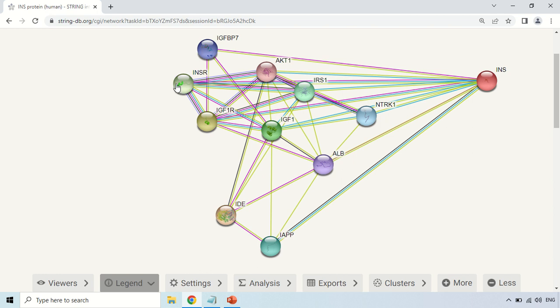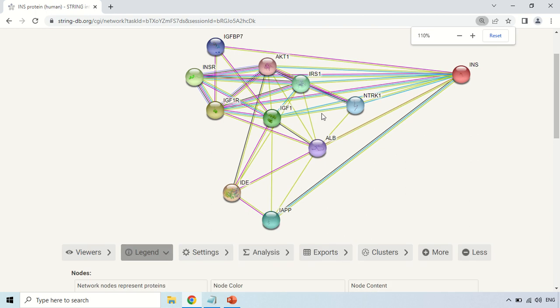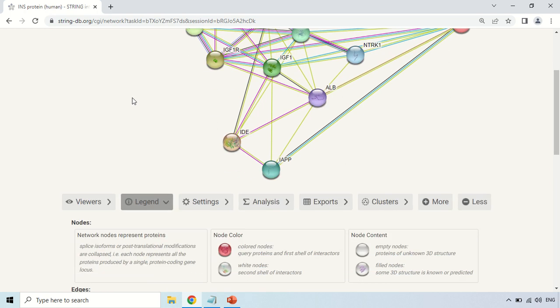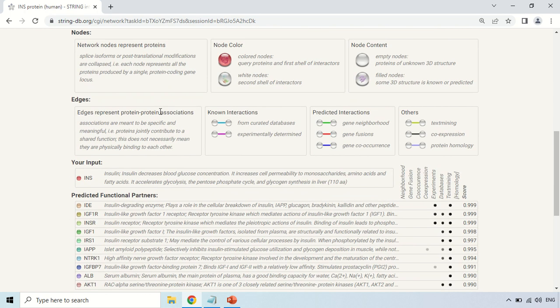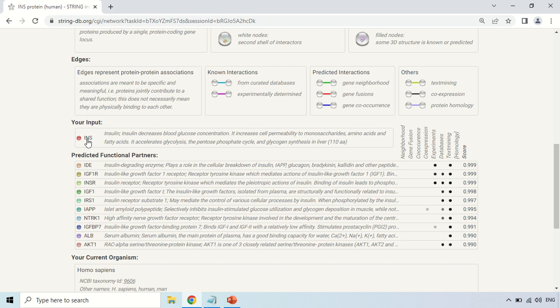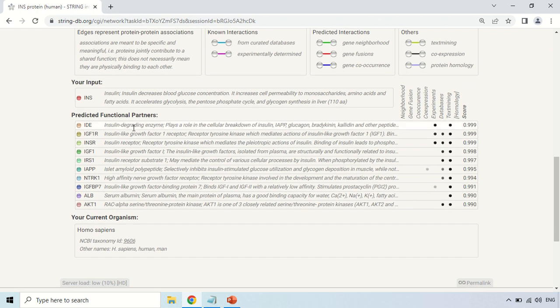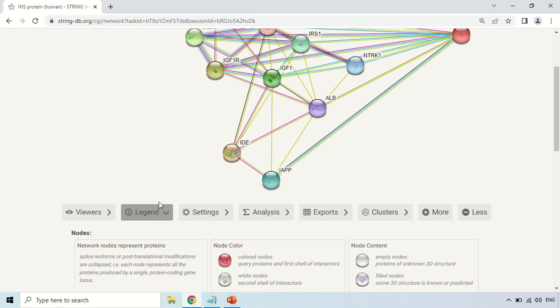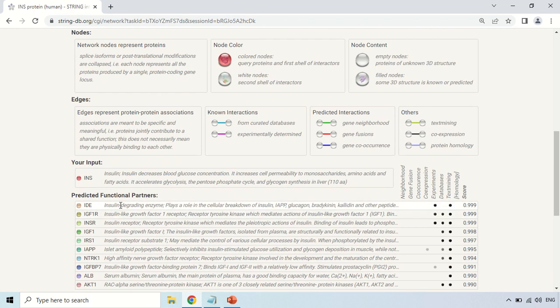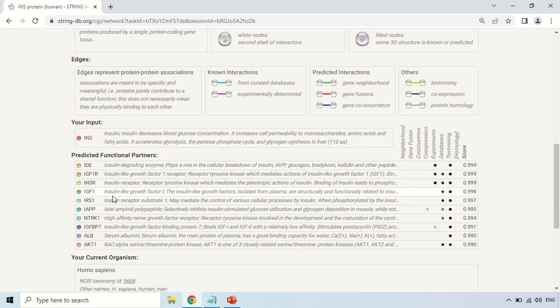These proteins also show interactions with each other, which is why the network is created here. To see the nomenclature or names of these proteins, this information is also available in the legend section. Scroll down here — this is your input sequence, insulin (INS), and here is the function of this insulin. These are the sequences with which your insulin shows interaction. For example, IDE stands for insulin-degrading enzyme, and IGF1 stands for insulin-like growth factor 1, along with their functions.